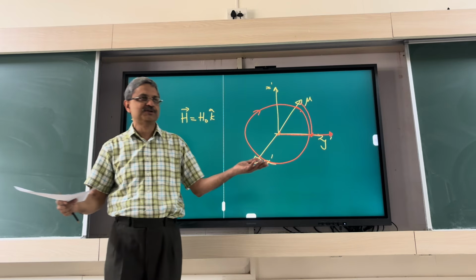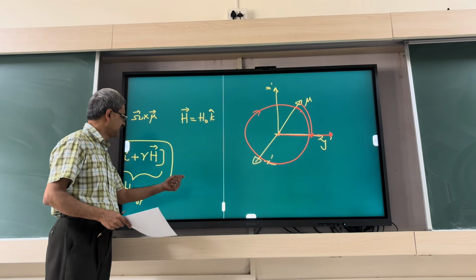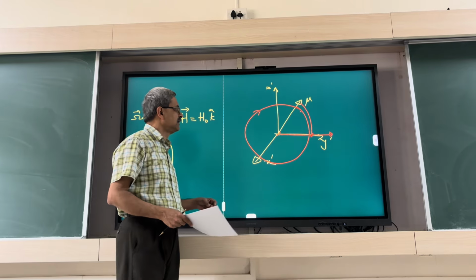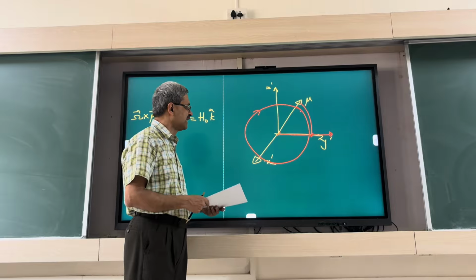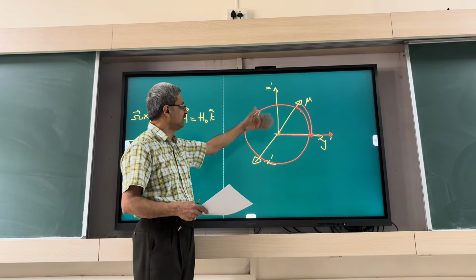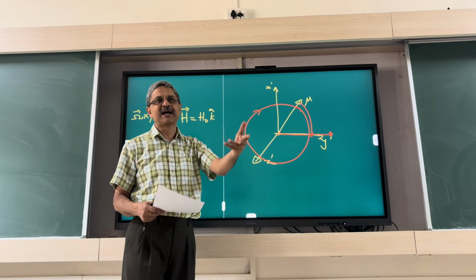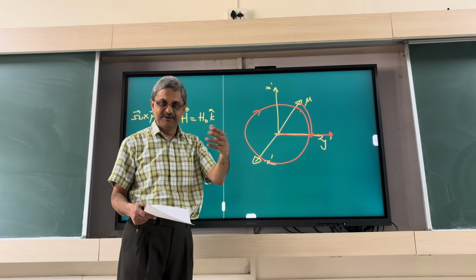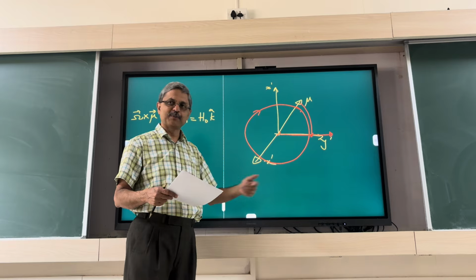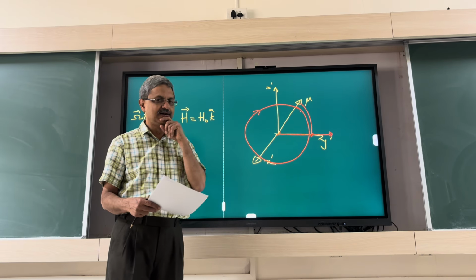It's like a gyroscope motion, and resonance corresponds to matching the RF frequency with the precession frequency, and one can describe the dynamics by going to a rotating frame and then, just qualitatively, even argue what happens. We'll next see the quantum mechanical equivalent. You have to write in principle the Schrodinger equation. You have some time dependence of the magnetic moment operator, and then you apply an RF field, how all that happens. So that will be taken up next time.